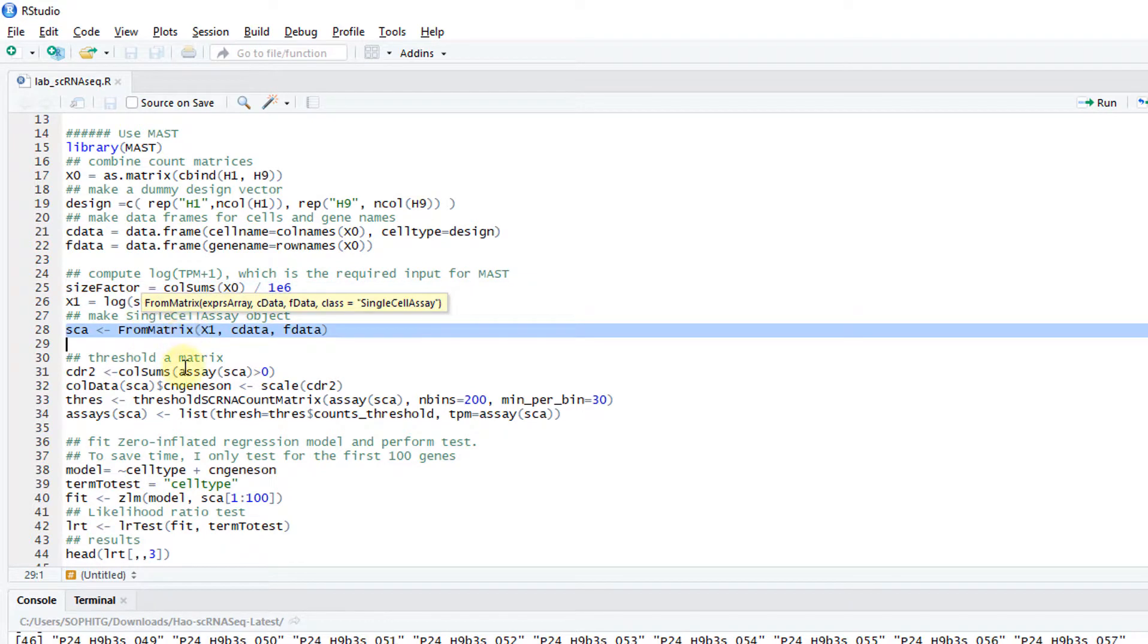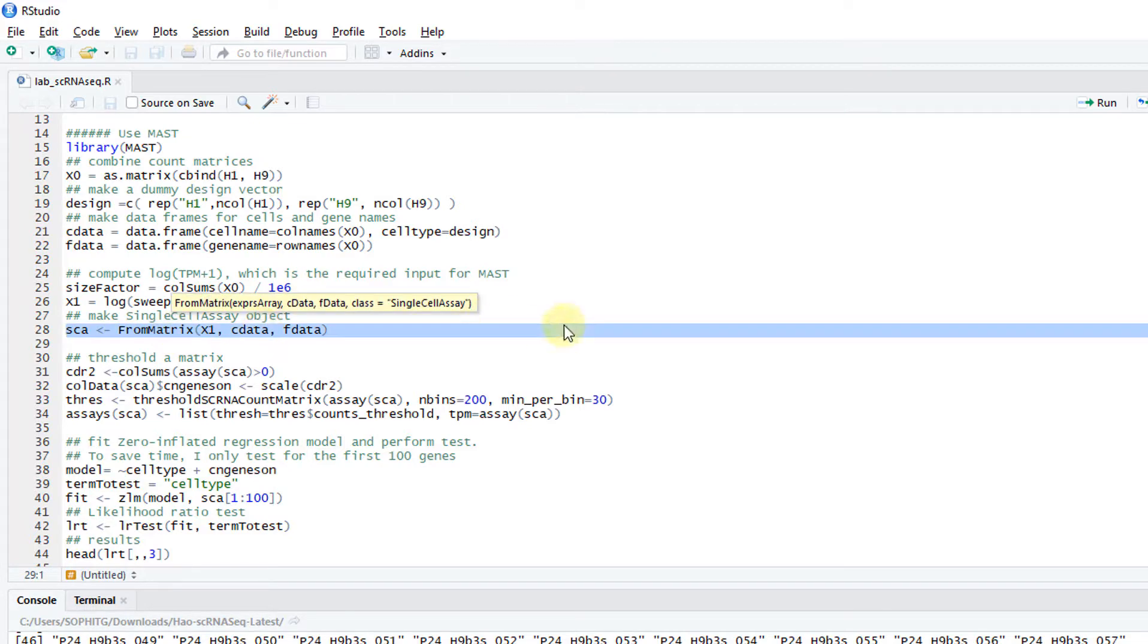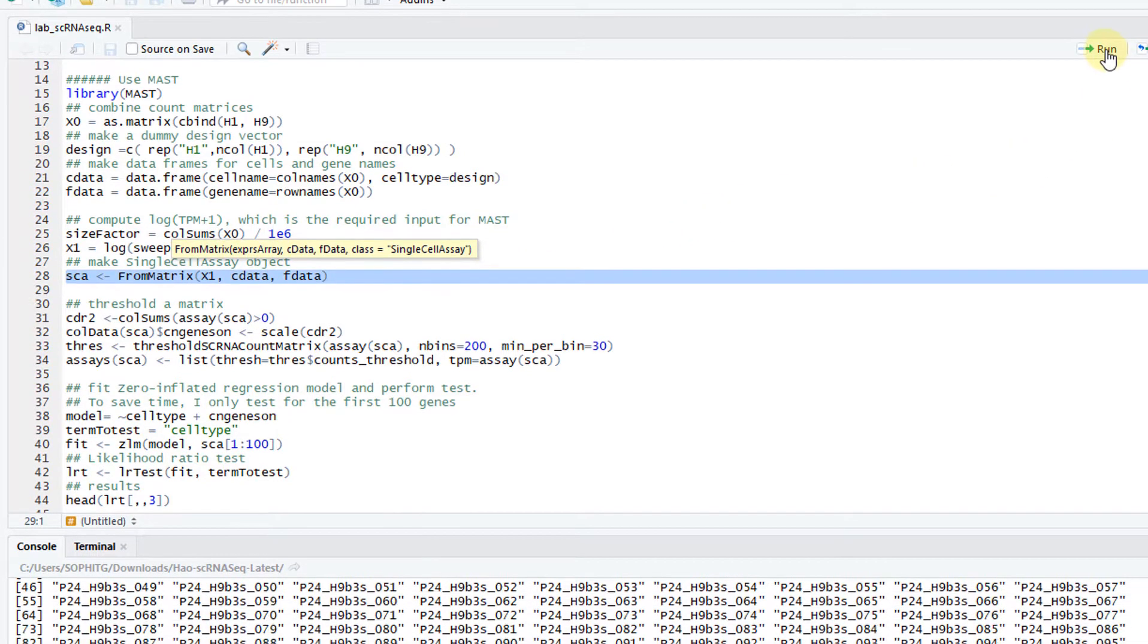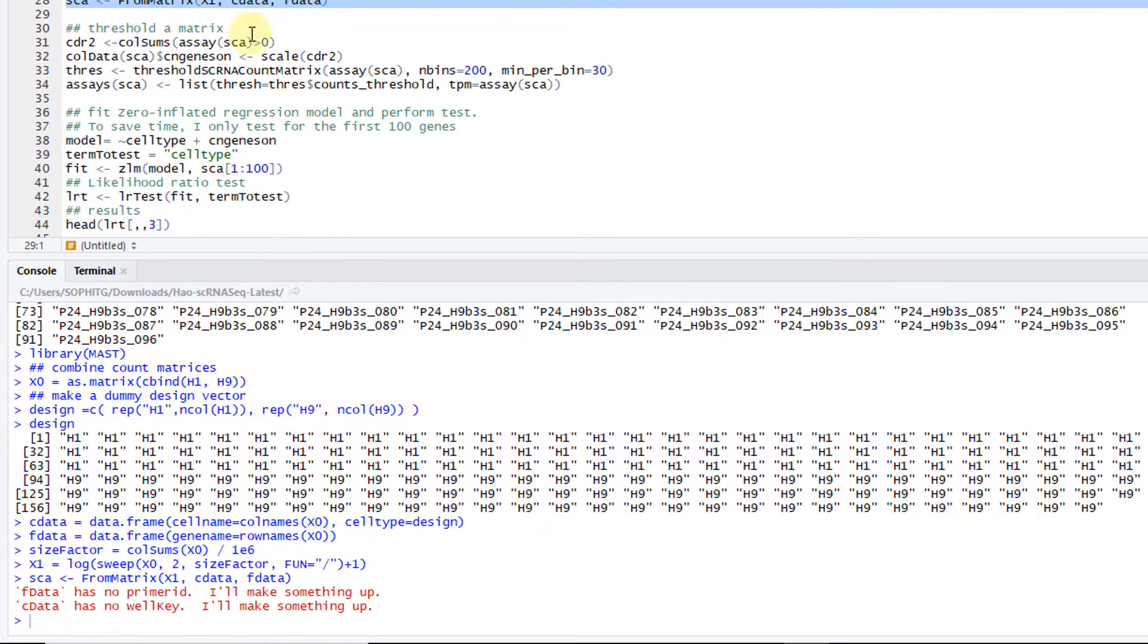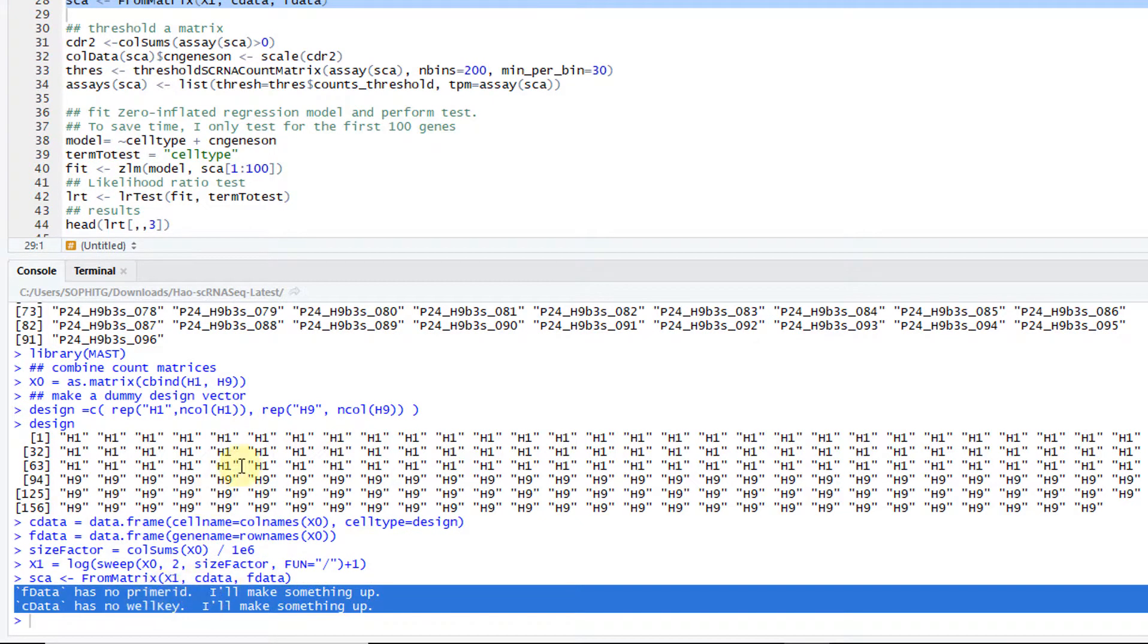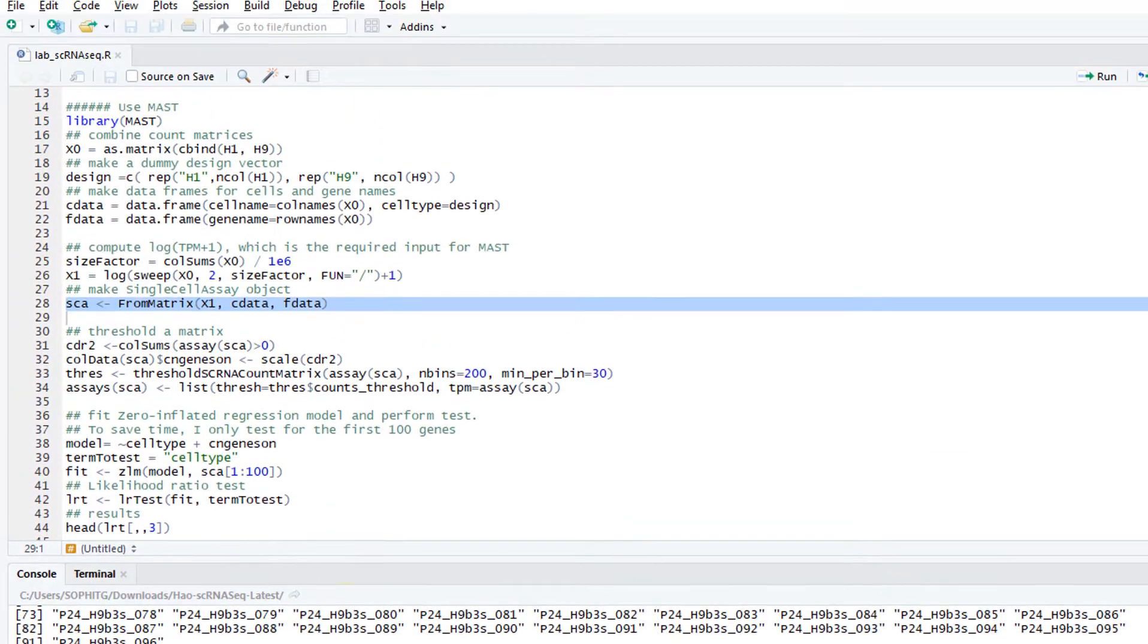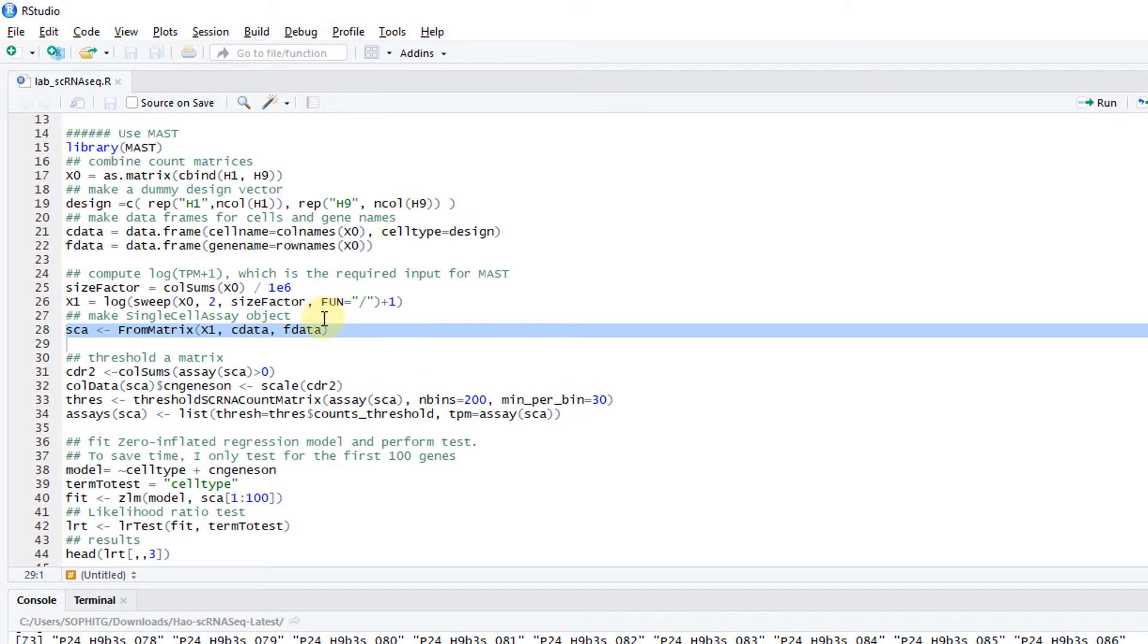From the matrix, I want to create this single cell SC object, which is an object internally defined by MAST. I call it SCA. There's some warning messages. You can ignore this because this is kind of a fake data. No primary ID, but that's okay.